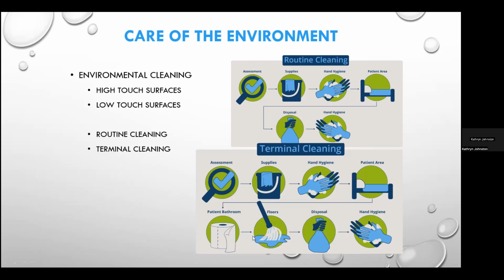This is particularly important in laboratory areas where there is a preponderance of potentially infectious materials, and you could have unrecognized droplets, splatters, and splashes. So you want to make sure that the mop that's being used in there has a removable head that is sent to the laundry for appropriate washing.